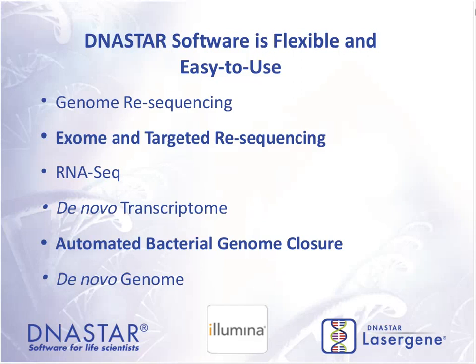We also have de novo genome assembly capability. Most of our customers focus on microbial genomes or smaller eukaryotic genomes. We have a very stringent, very accurate de novo genome assembler. So these are a number of different workflows. The ease of use I would like to show you by going into the software. So at this point, I'm going to jump out of the PowerPoint and share my desktop.